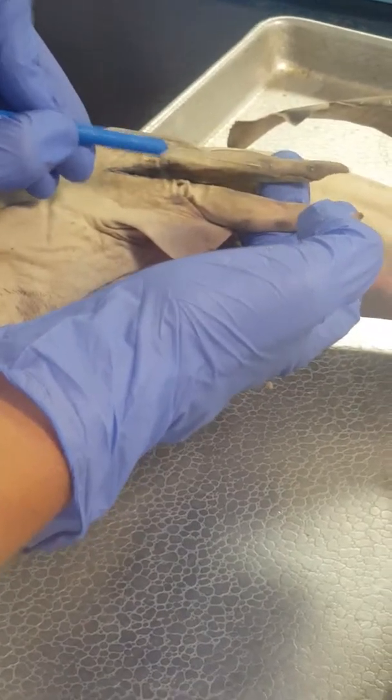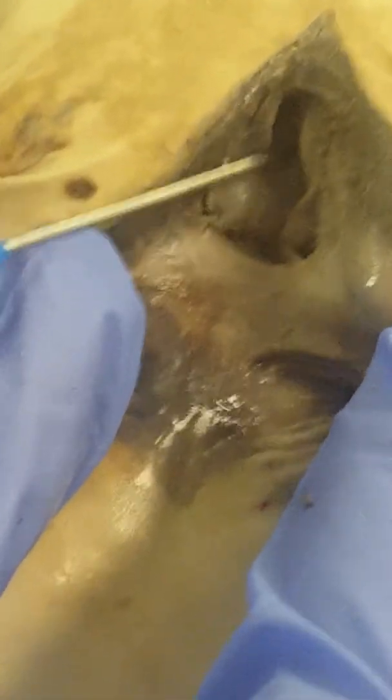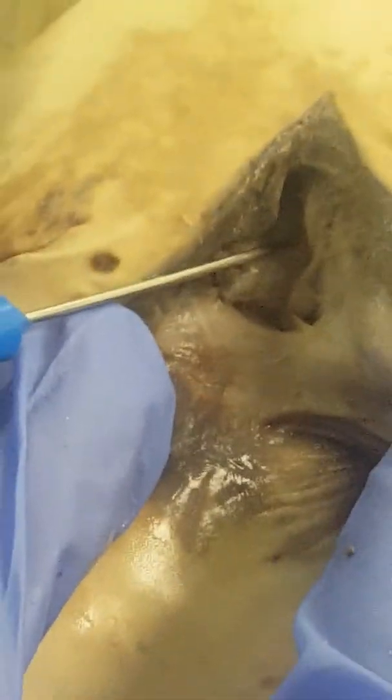Gill slits are through here on the lateral side of the shark. Claspers are these elongated appendages here. Since we have a male, it's the urogenital papilla — urogenital because it's male. It is right here tucked underneath the claspers.